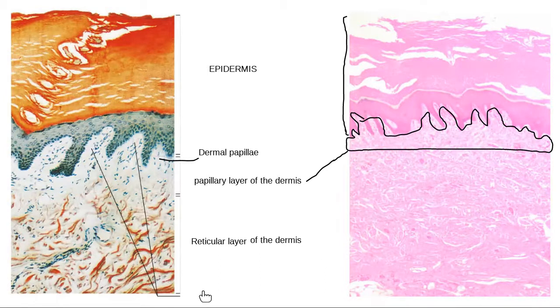In this picture we can't really see it. Down below all of this stuff would be that hypodermis that we saw on the other slide. And you can maybe see a little bit of it on this slide right here. I think I might see a little bit of it because of the kind of tissue that I see right here. What kind of tissue is this down here that I have in that last layer called the hypodermis? Let me add that to our list. Hypodermis, yeah. The hypodermis has adipose tissue. So it looks like I might be seeing a little bit of adipose tissue down here. If I'm seeing adipose tissue, that's the kind of tissue in the hypodermis. So the lowest layer of the skin, the hypodermis.